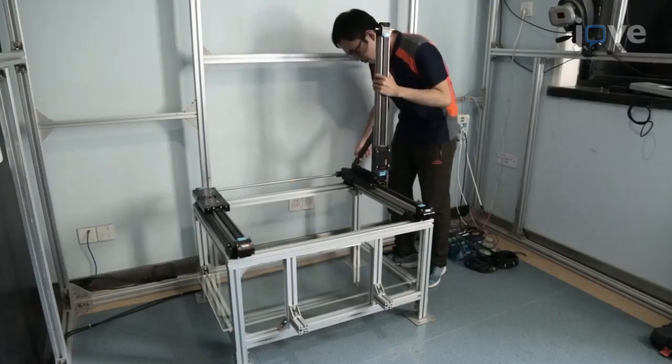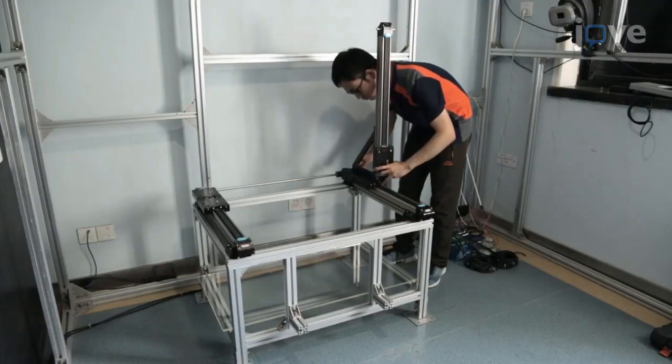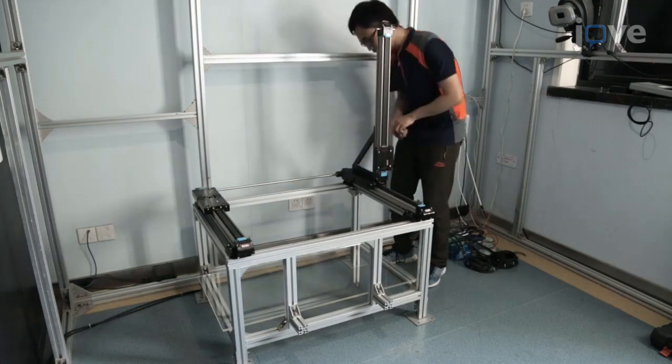Fix the other right-angled sides of the two triangle frames to the sliders of the two Y-rails with screws.